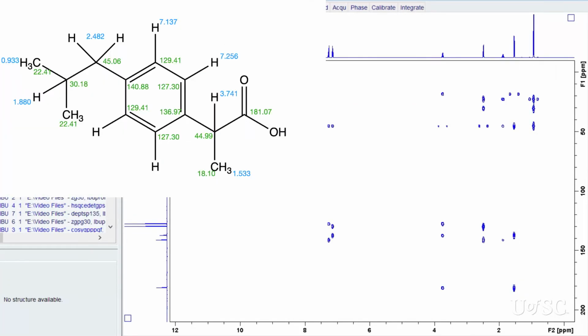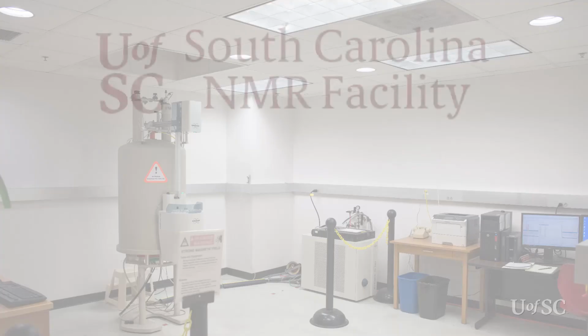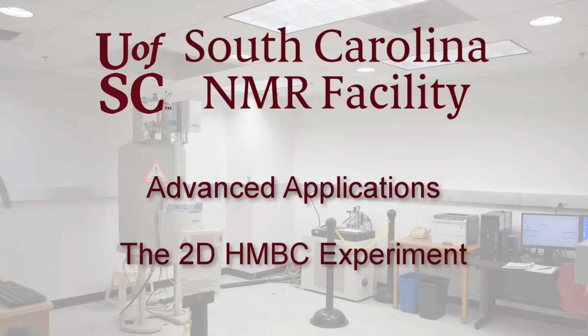This concludes our video on running and interpreting the HMBC experiment. Combined with information from the 1D spectra, COSY and the HSQC experiments, the HMBC results are extremely helpful for making chemical shift assignments and for piecing together unknown structures. Every researcher using NMR should be familiar with these experiments and use them for solving structures and making spectral assignments.